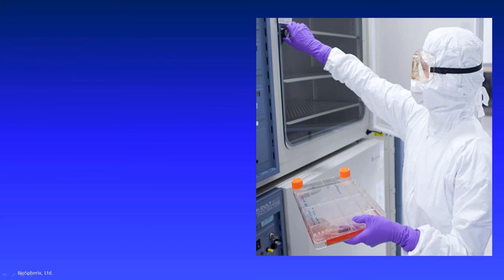A lot of people think of this. They think of a traditional room air CO2 incubator. But I'm going to make the case that actually this is a terrible place for cells and tissues. For one, from the cell's point of view, the oxygen inside is far too high for cells that come from inside the body. And the CO2 and temperature are fine as long as the door stays shut, but every time that door is opened, whether it's you accessing your cells or someone else in the lab accessing theirs, all the conditions change. So this is a highly variable environment from the cell's point of view.